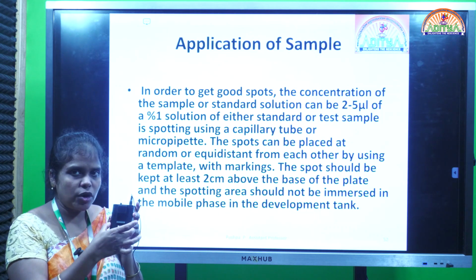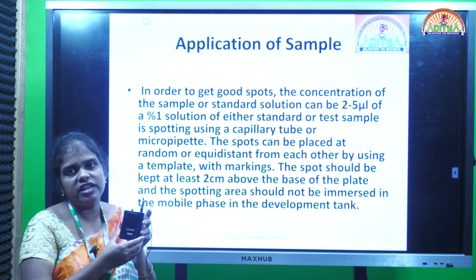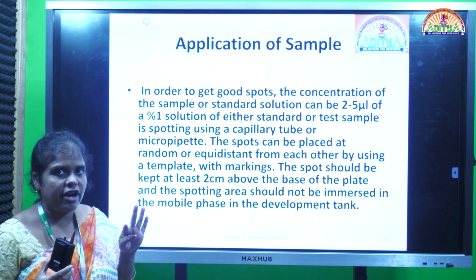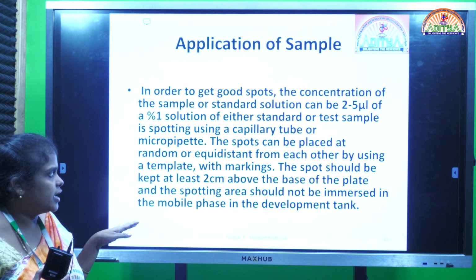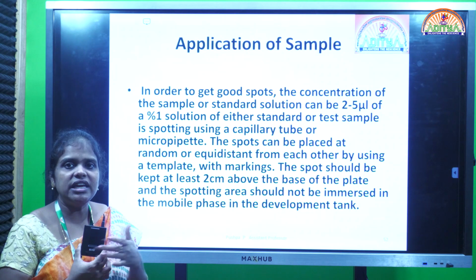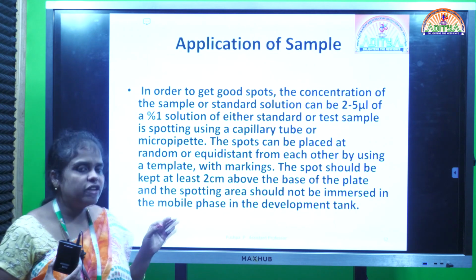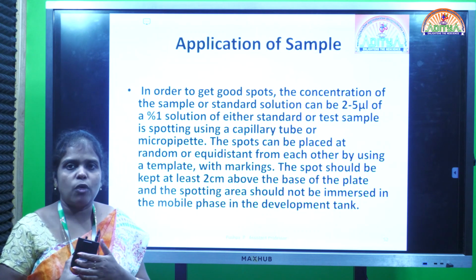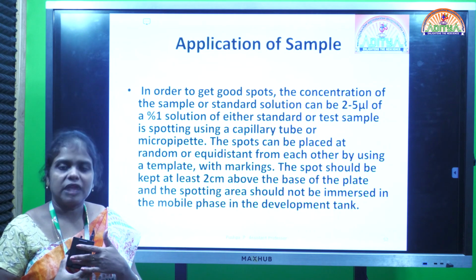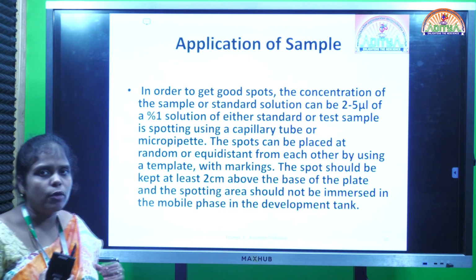And that sample spotting also you have to start 1 inch above the base of the TLC plate. You have to know these conditions before applying, and all the spots should be mostly at equal distance. After applying the spots, you have to wait for some time to get the spots dried, so that they get incorporated with the stationary phase and mobile phase.